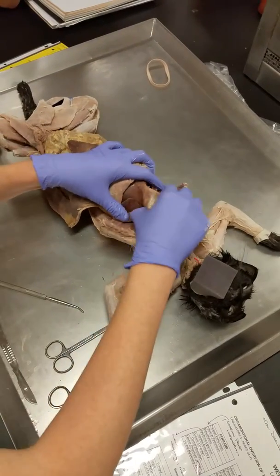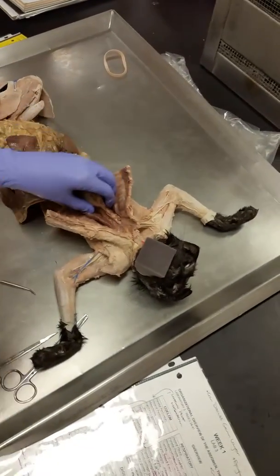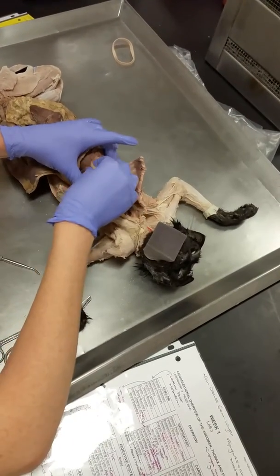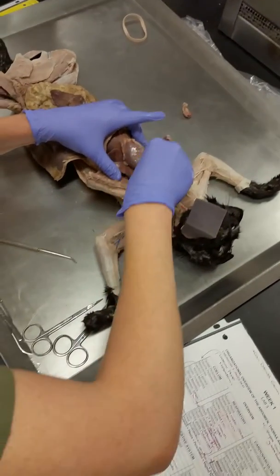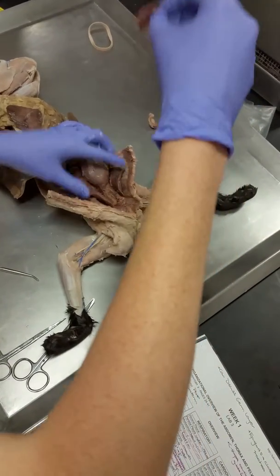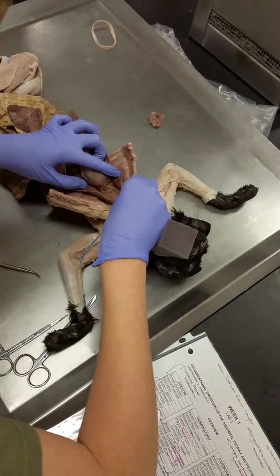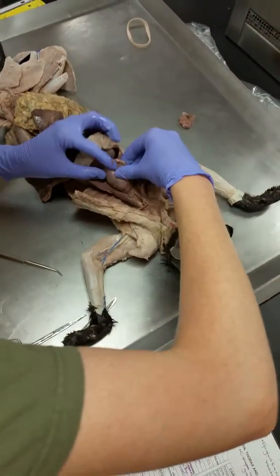Okay. So all of this is the heart, and his heart's fatty. And what you want to do when you've got your heart here, there's gonna be a bunch of fat and stuff lining your heart. See how I can just rip this right off? You guys want to just get all of this off of here. So just gently pull it off, and you'll actually pull off this little glob of weird brown fat. Okay, and that's actually the thymus gland. We're gonna pull that right off of the heart too. So I'm just going to get as much of this fat off of here as I can.